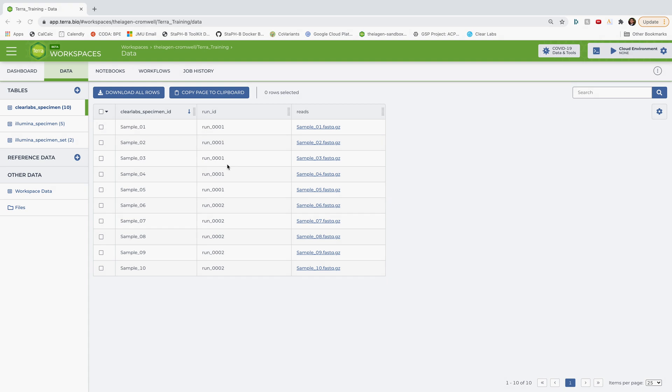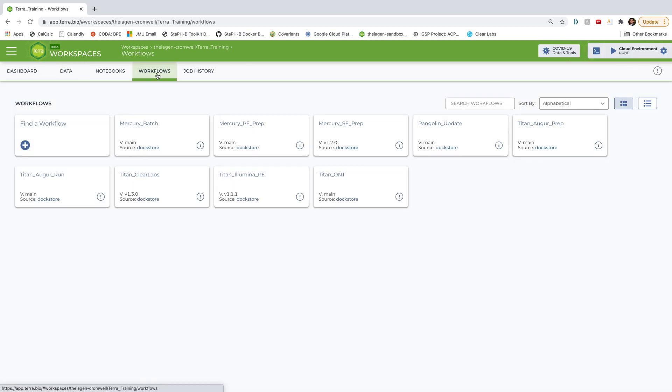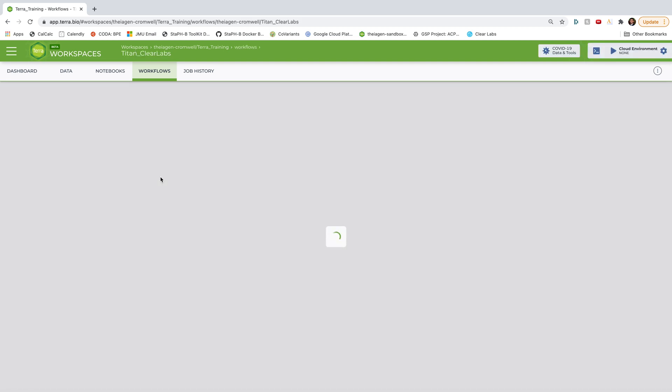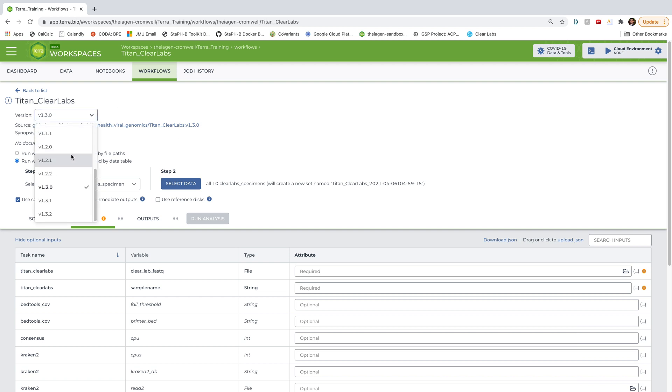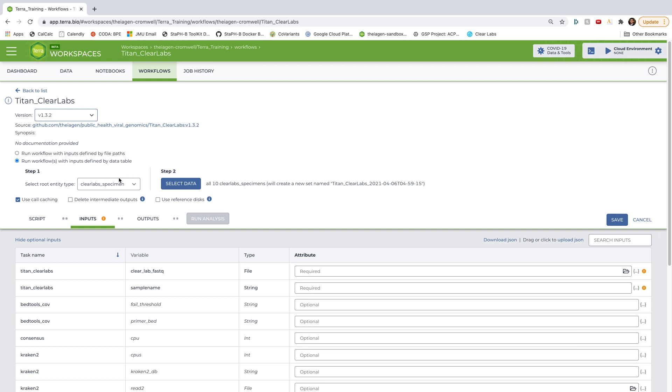Okay, so let's start by selecting the appropriate workflow. So I'm going to go ahead and navigate up here to workflows. And you can see here that I already have the Titan Clear Labs workflow available to me. So I'm going to go ahead and select that. And then I'm going to go ahead and select the latest version that's available to me. So for me right now, it's version 1.3.2.